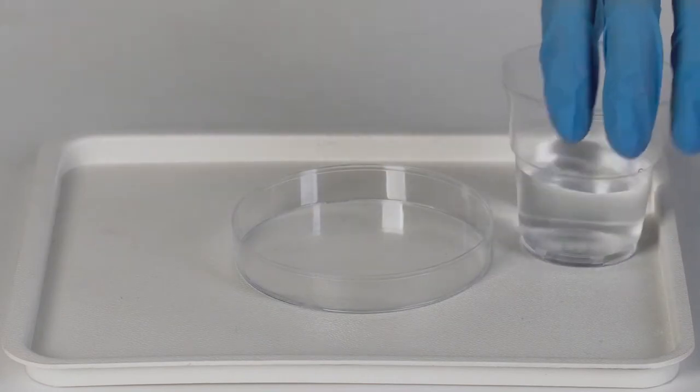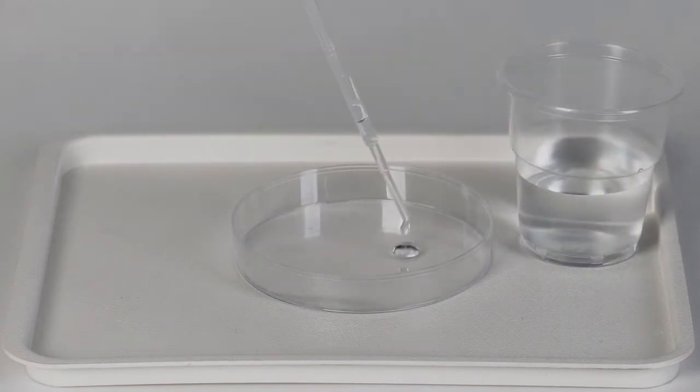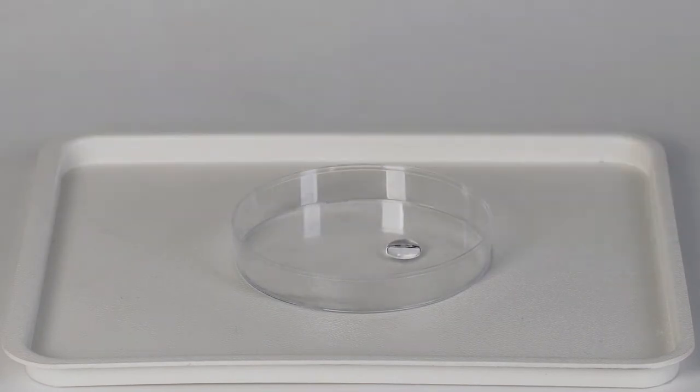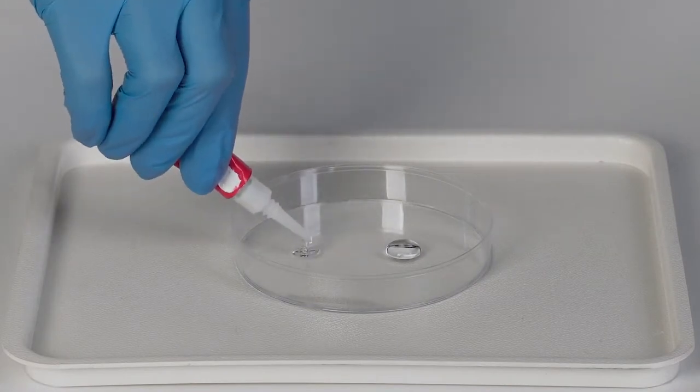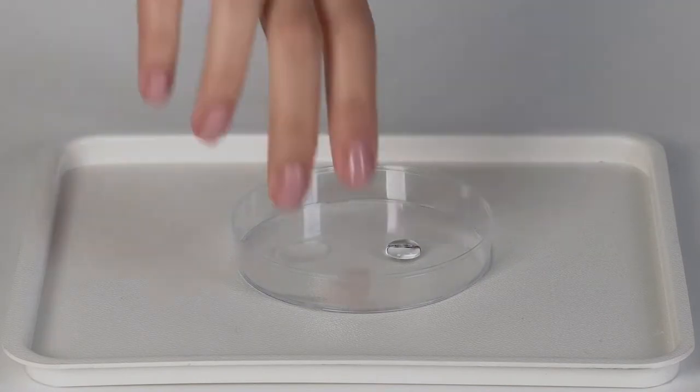Using the Pasteur pipette, place a few drops of water on the Petri dish. Next, place a few drops of superglue on it. It's important that the two don't mix.